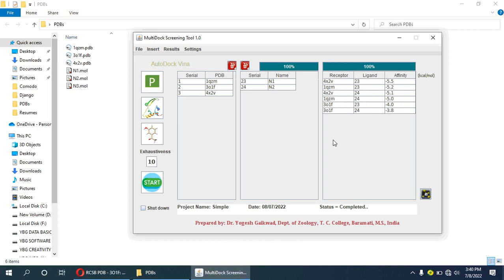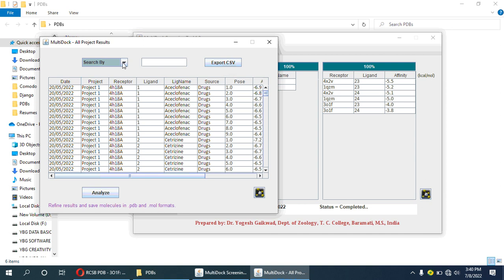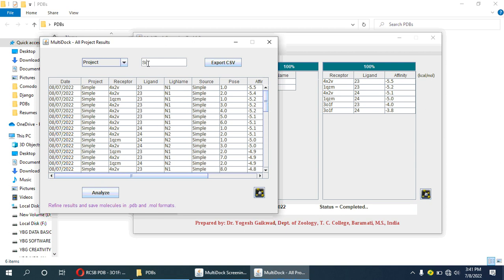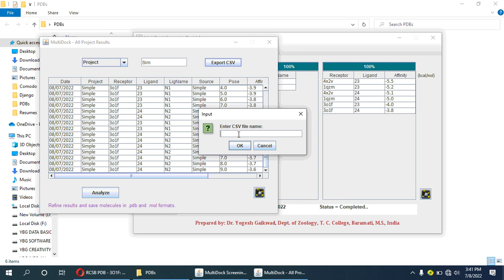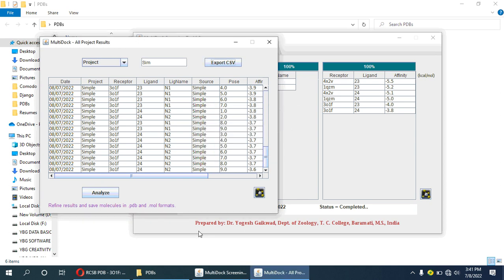All three proteins and two ligands have been docked successfully. We can see the results by going to this menu — the project name is 'simple'. We can export this result in CSV format. I will save the results as 'simple1', and the result has been saved.